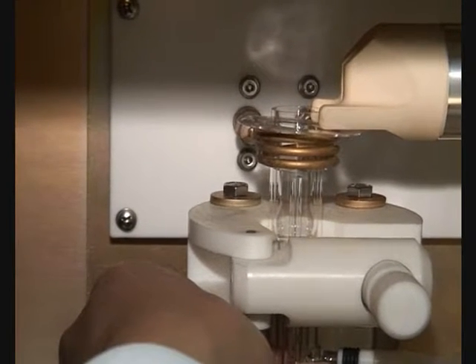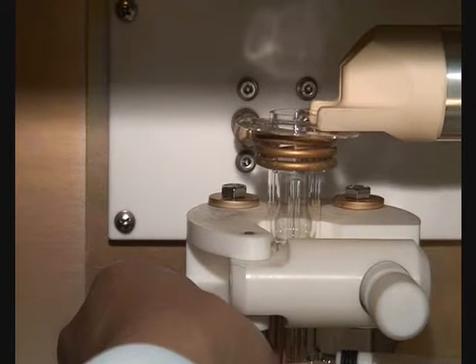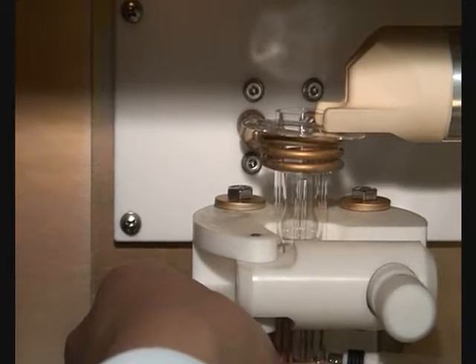Gently move the torch up and down until the top of the intermediate tube is approximately 2mm below the bottom of the induction coil.